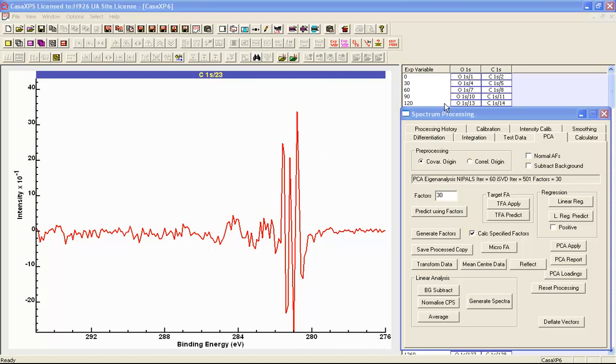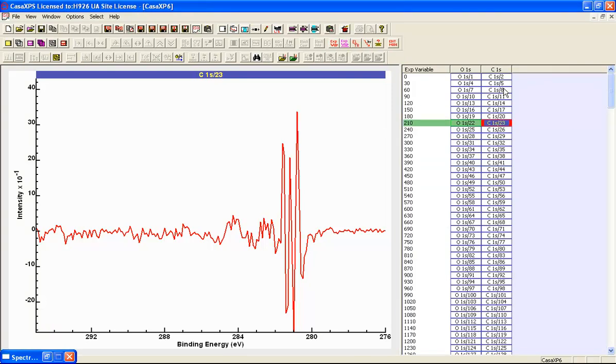Having calculated these principal components, we now have an understanding of how many of these are significant to our data set. So we've got 1, 2, 3, 4, 5, 6, 7. So I'm going to include actually this one too. So I'm going to say 8 abstract factors. This means we've got an 8-dimensional subspace onto which we can project all of these carbon monomer spectra.